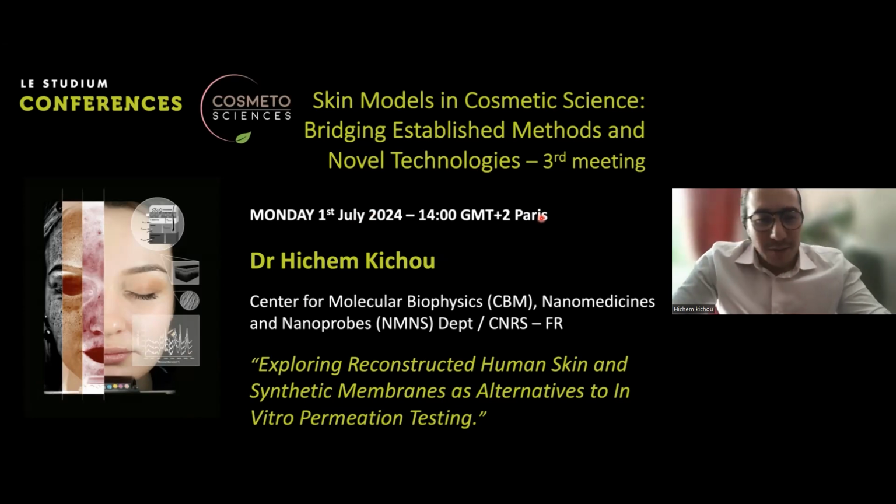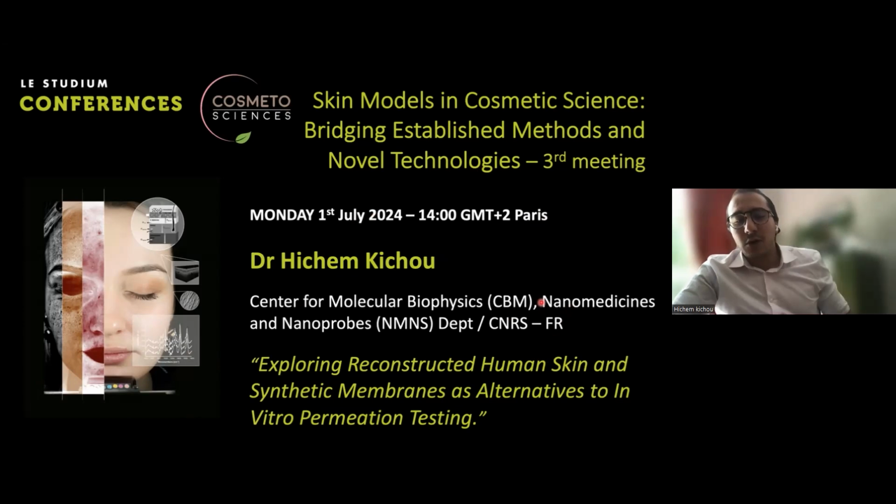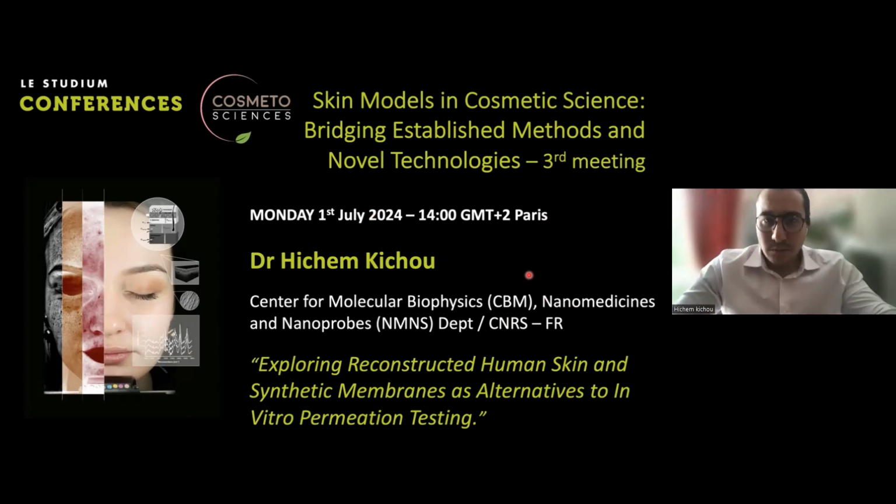Probably my last presentation with the Nanomedicines and Nanosounds or Nanoprobes teams. So my work will be on exploring reconstructed human skin and synthetic membranes as alternative to IVPT, or in vitro permeation testing.